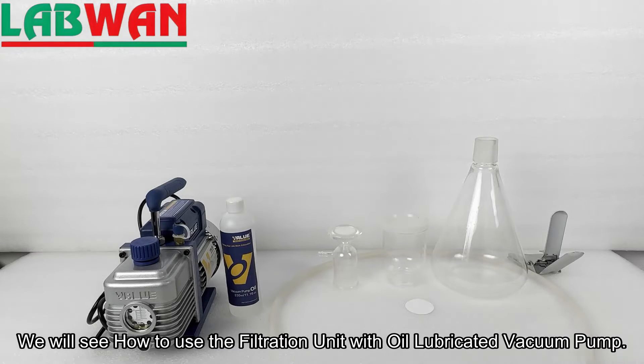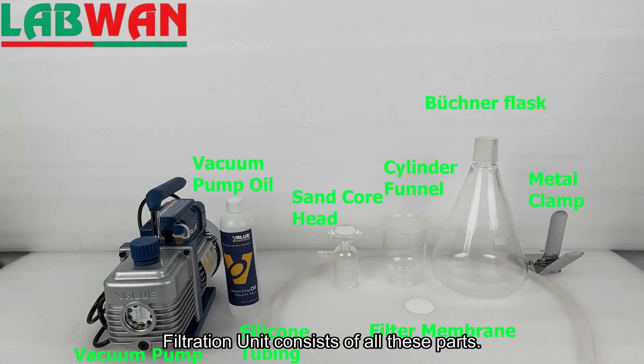We will see how to use the filtration unit with oil-lubricated vacuum pump. The filtration unit consists of all these parts.